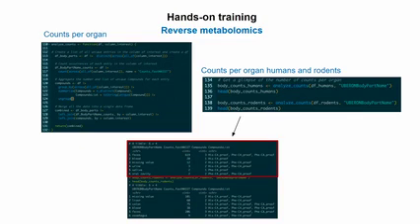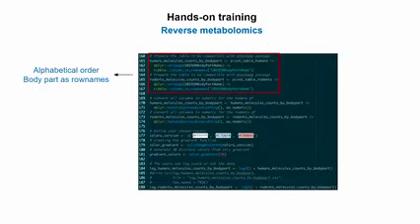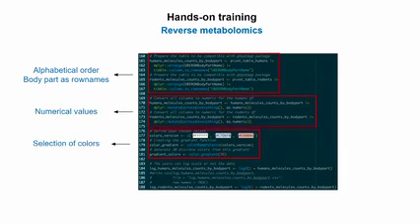And then you're going to have a table that will be generated that looks like a summary table, where you have, okay, I have feces, I have 619 matches, and it combines all those different molecules. So I have histidine C4, phenylalanine C4, and phenylalanine cholic acid. And then here is just to reformat, right? It's just modifying tables to make it compatible with the pheatmap package for data visualization. So it's just formatting, and just, again, more formatting, classifying everything into alphabetical order.